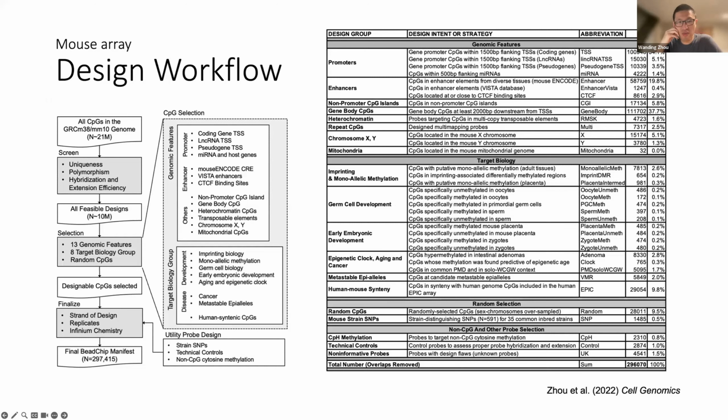That's the main motivation behind looking at the human-mouse conservations or differences in methylomes. So we designed those probes so that you can apply a human array like an EPICv2 and a mouse array. Then some of the CpGs can be directly compared, in the sense that they go to the same genomic regions, the same gene, the same position with respect to that gene, for example promoters, UTRs, or first exons. They are then considered equivalent between the two species.